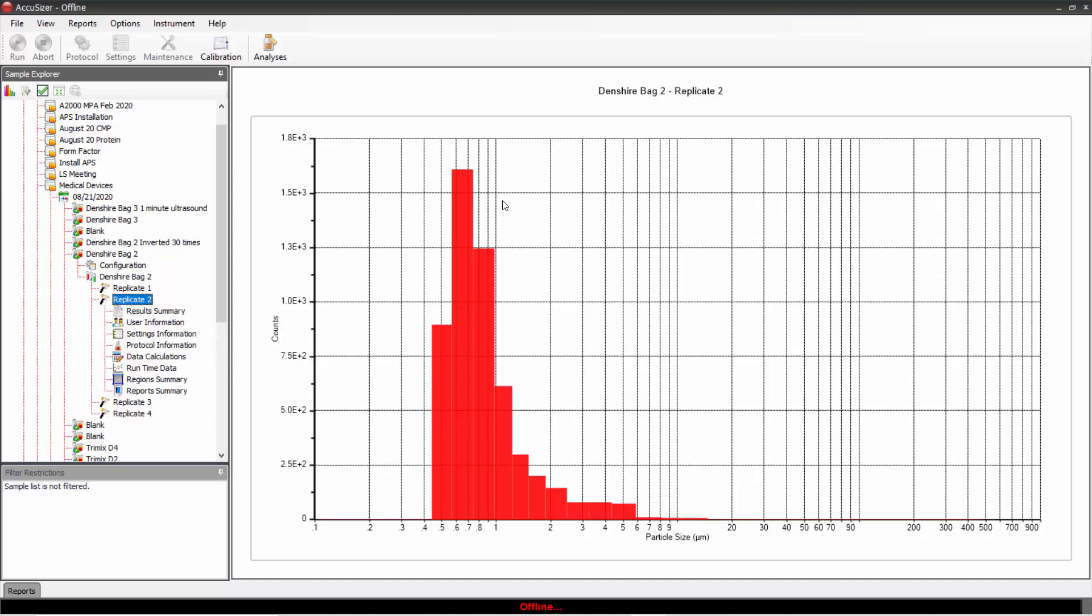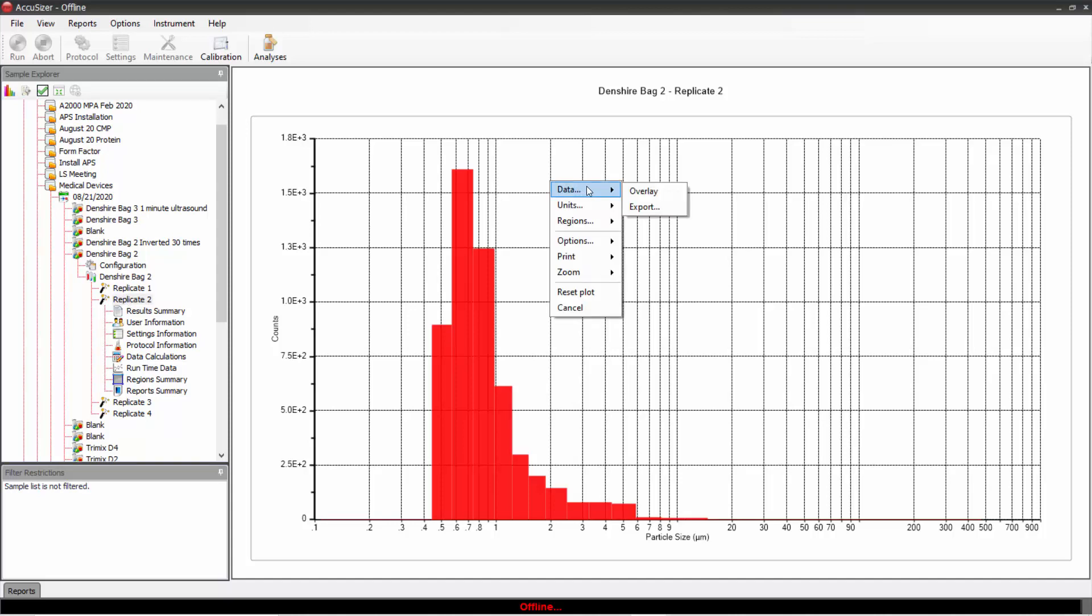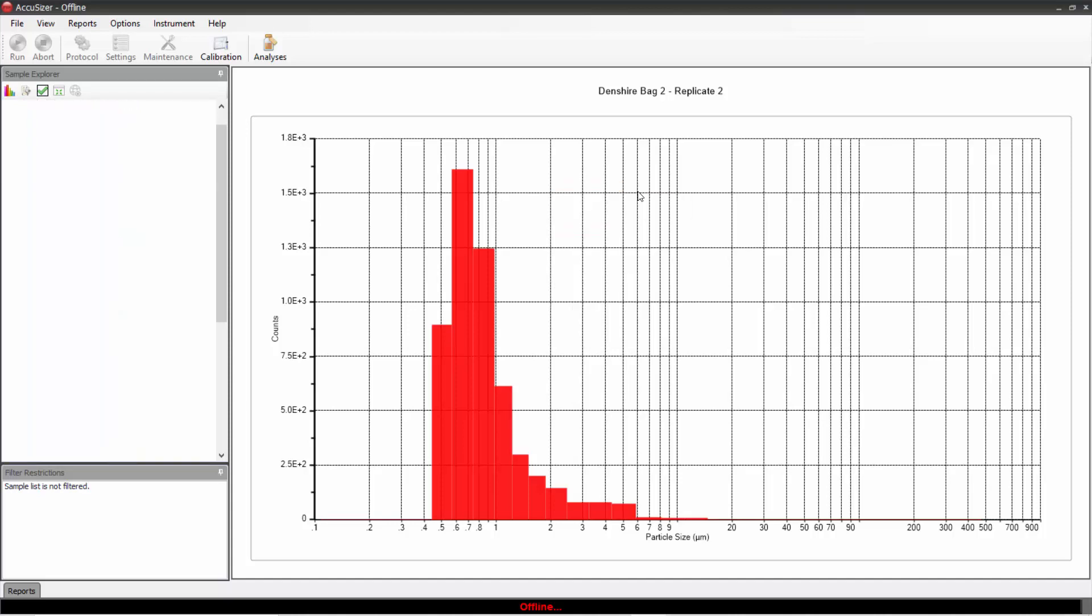I'm going to open one of the results here, replicate two. I put my mouse inside the graph, right click, and click on data overlay.